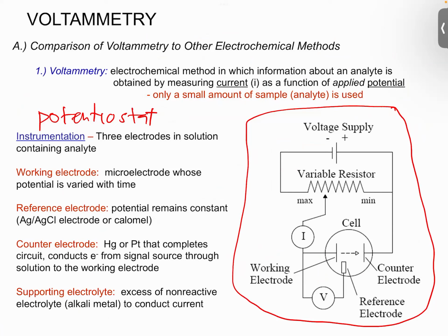So this is the basic structure of a potentiostat. And of course, we are not discussing the circuit or whatever, because we are not going to do a prototype. This requires engineers, those who are well versed in electronic parts, to do the prototype for us. As a chemist, we don't do this job. We just need to know the structure so that we understand how it works.